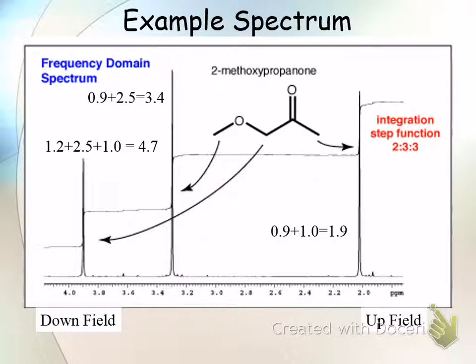And the way I actually teach it is to do Post-it notes. So when we do it in lab, I'll give you a stack of Post-it notes, and you get a formula. You draw functional groups on Post-it notes, and then you just start moving stuff around until it fits.